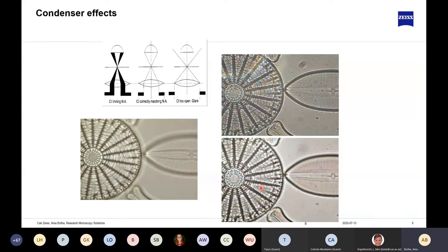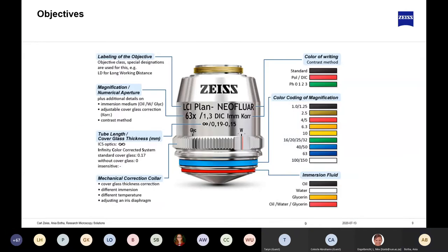Now that I've spoken about the condenser and numerical aperture of the objective — where do you find the numerical aperture of the objective? There are a whole bunch of markings on each and every objective, regardless of the make. I'm going to talk you through from top to bottom what each piece of information means.